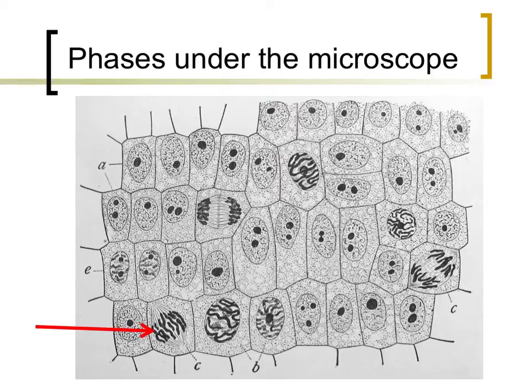There is no great picture of metaphase, the second phase of mitosis in this slide, so I pointed towards the one that looks closest. What is typically found during metaphase is a line of chromosomes along the center of the cell. The way that I could distinguish metaphase from anaphase, the next stage that we'll talk about, is quite simple. If you can draw one line through the cell and make contact with every single chromosome, you are probably looking at metaphase.